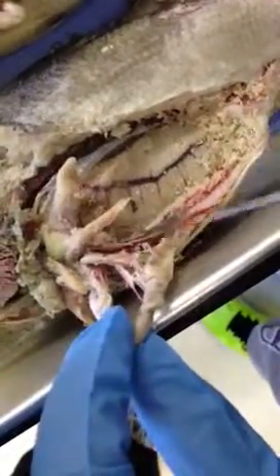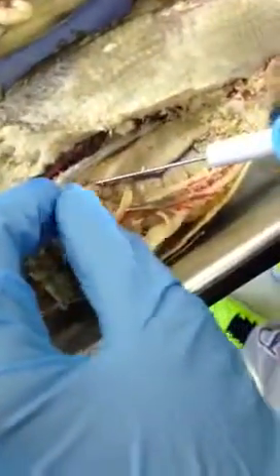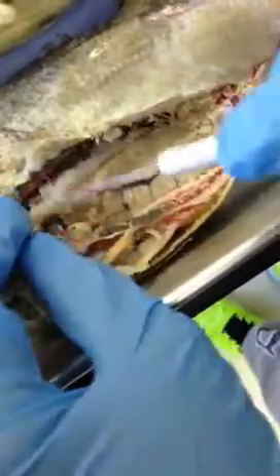And in the intestine, before the small intestine, you have the mesenteric arteries right here in the loop. So that's the intestinal mesenteric arteries. And the dorsal gonadal arteries right here. We should go on this fish because it has a better view. It's actually attached this time. Right there we have the dorsal gonadal.